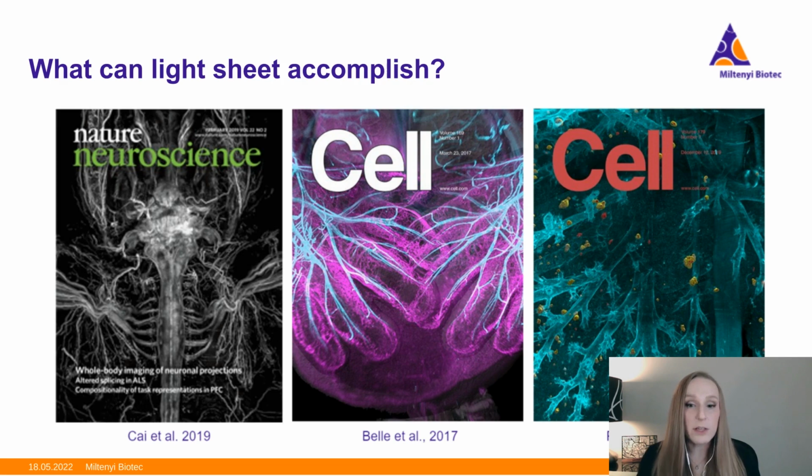So this has made light sheet microscopy a method used across various fields of science, including neuroscience and immuno-oncology, to visualize these larger 3D samples, organs, and small animals, as you can see in the covers displayed on the screen here. Now, those of you that have done light sheet microscopy know that there is a lot more to it than just imaging the samples and being able to produce images like this. To achieve these types of cover art, there are a couple of considerations in sample preparation and imaging conditions.